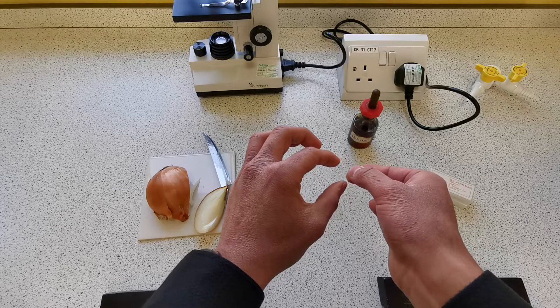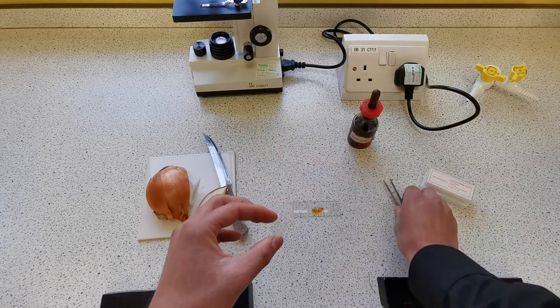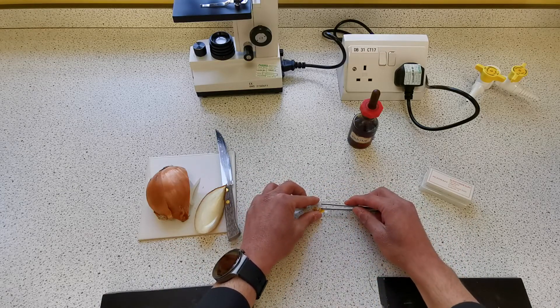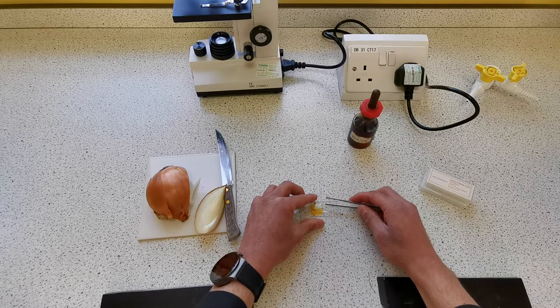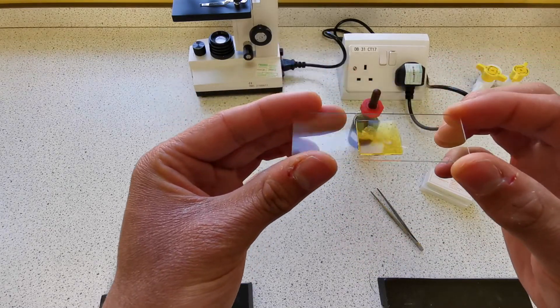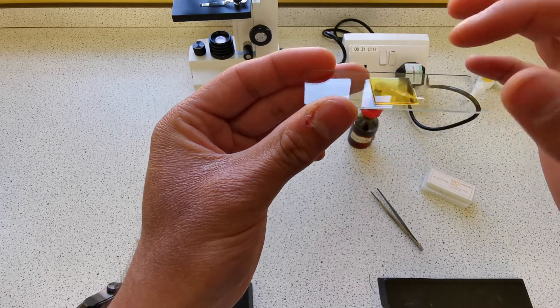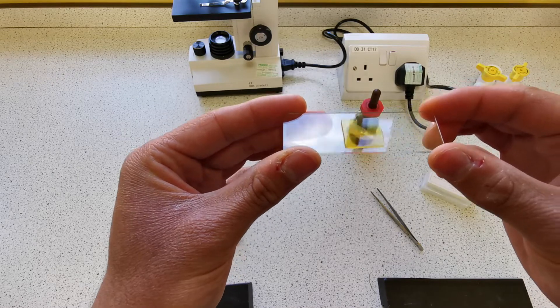We don't want there to be any air bubbles between the cover slip and the slide, so you can use your forceps to gently lower the cover slip onto the sample. Afterwards you'll be left with something that looks like this — the onion on top, the cover slip above it, and the slide underneath. There's our prepared slide.